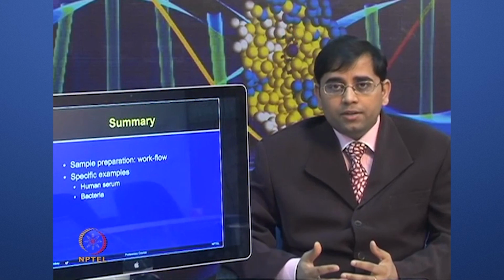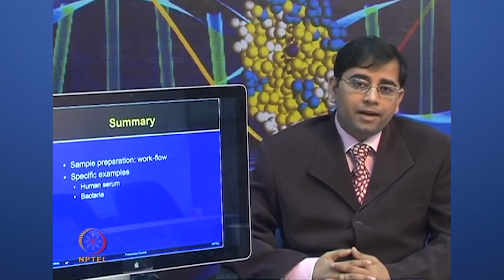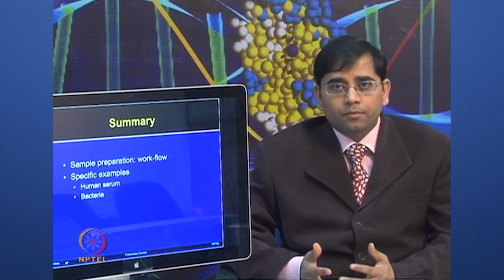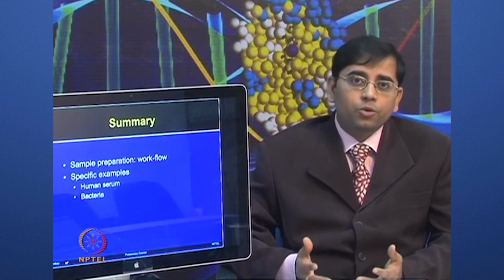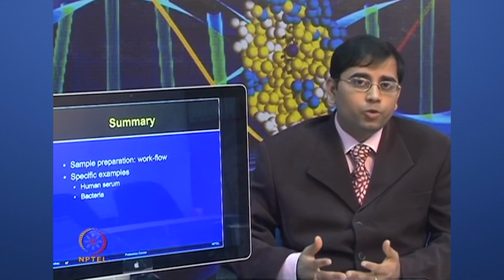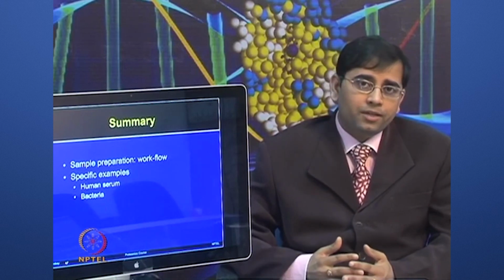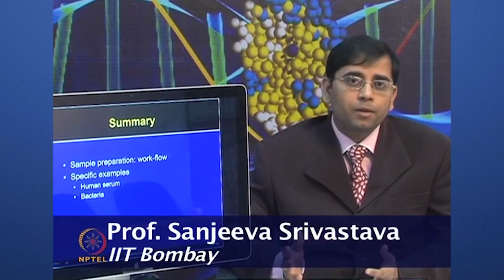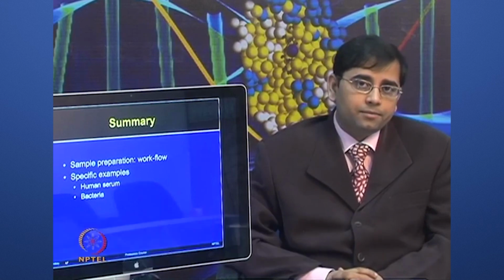We will continue our lecture, and in the next class we will talk about plant proteome analysis, followed by quantification. And once you have obtained a very good quality and quantity of the protein, then you are ready to perform the proteome experiment by using different techniques. Then we will start discussing two-dimensional electrophoresis and other gel based proteomic technologies, and in subsequent lectures we will talk about mass spectrometry based methods. Thank you.